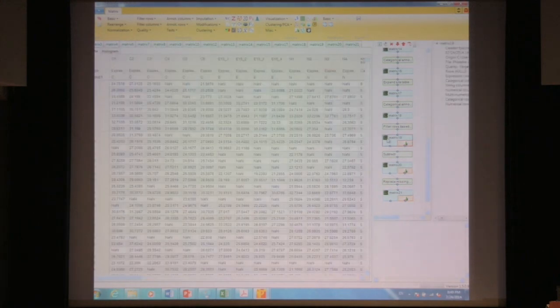Okay, if you preferred to be more conservative, I'll show you what a downshift would look like on even more stringently filtered data, but don't go and do this because it's not necessary. I'm just showing you.